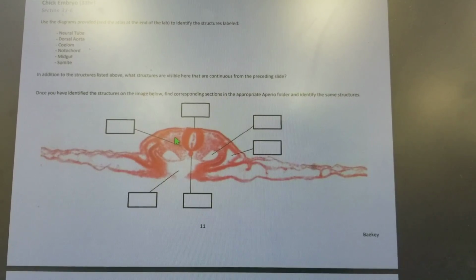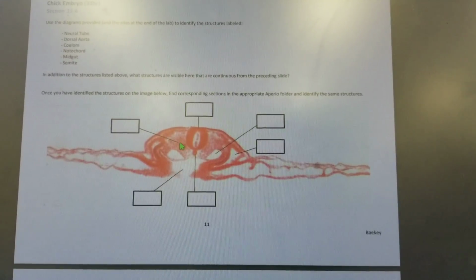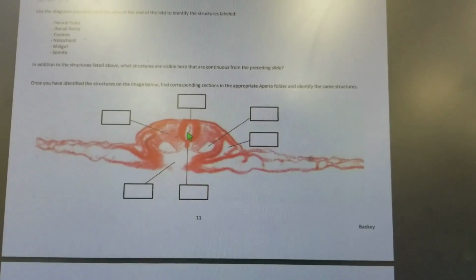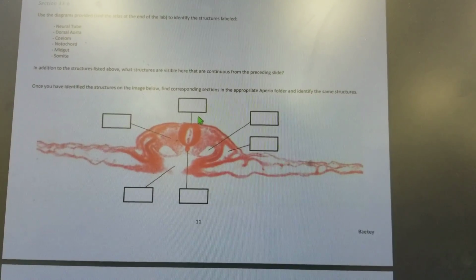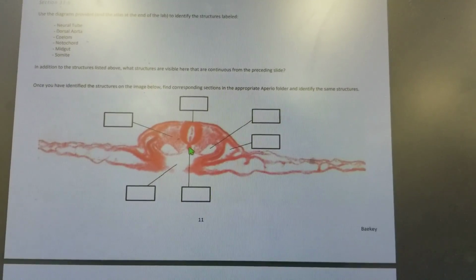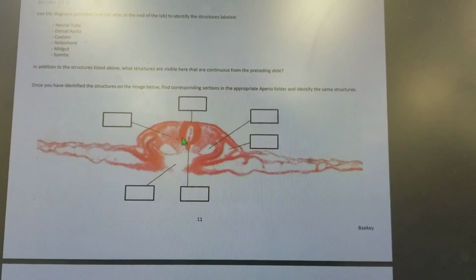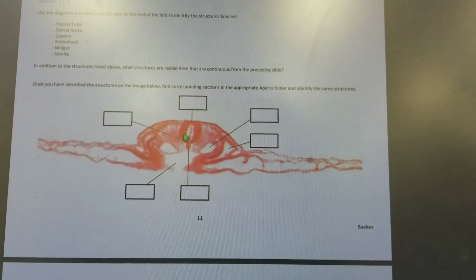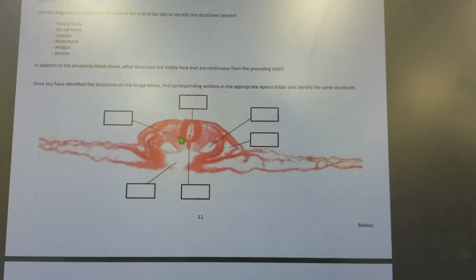And the paraxial mesoderm gets its name because it lies alongside the axis, the craniocaudal axis, which has been defined already by the primitive streak, and it's going to be defined by the notochord extending cranial to caudally, as well as the neural tube extending cranial to caudally along that primitive streak. So these are the somites, and the somites give rise to the body segments of the body.